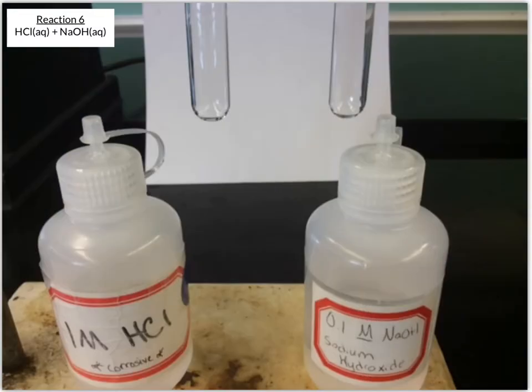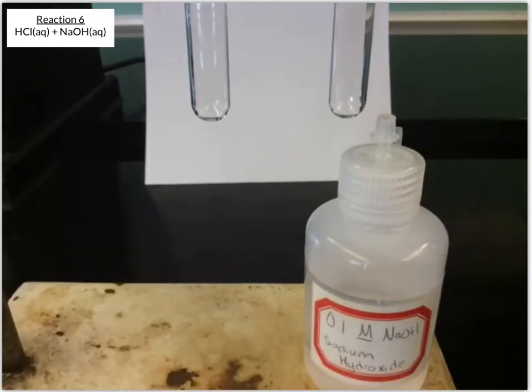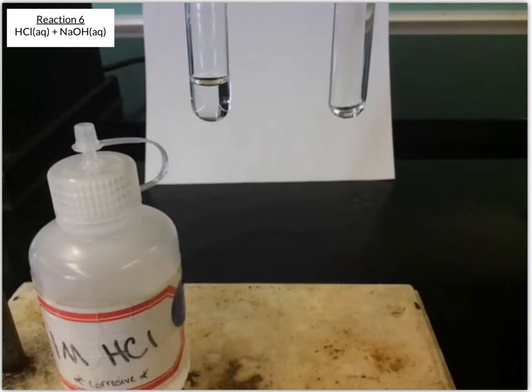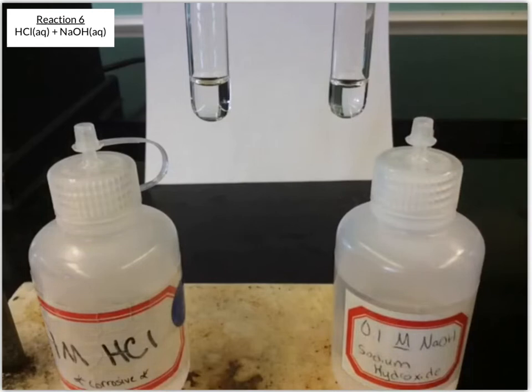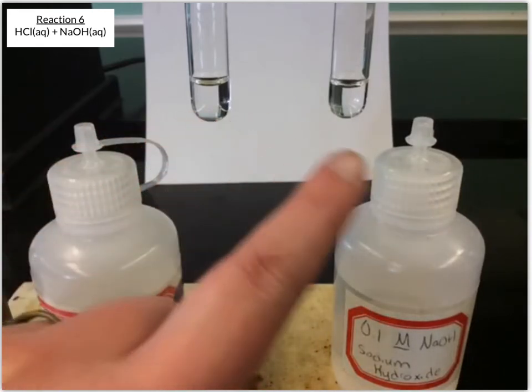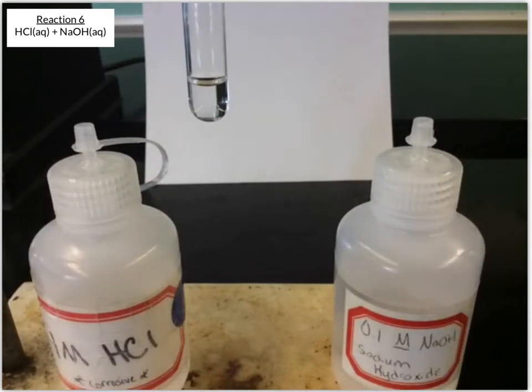Okay, next up for reaction 6, we're going to take hydrochloric acid and react it with sodium hydroxide. Okay, so I've got about 1 milliliter of each. We've both got clear colorless solutions. I'll take the sodium hydroxide and add that to the HCl.